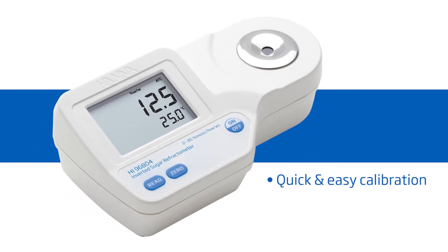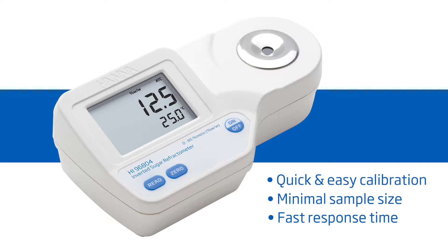It features one-button calibration, a two-drop sample size, and a 1.5-second response time. HANA Instruments provides you with the tools to succeed.